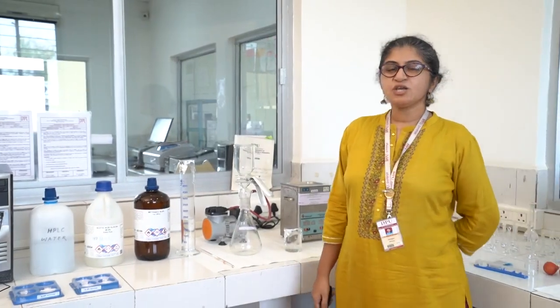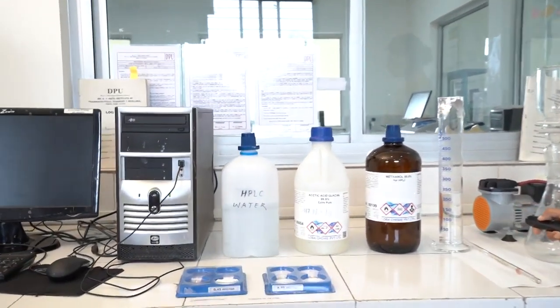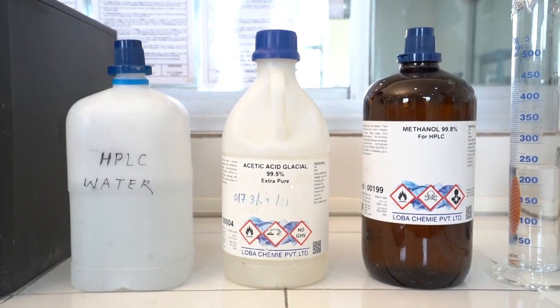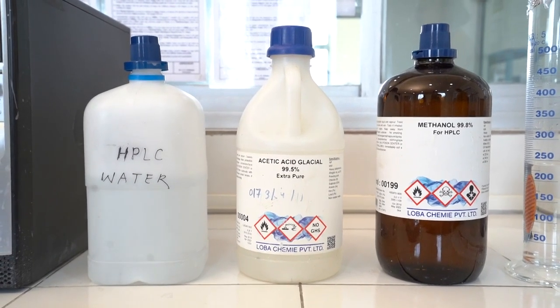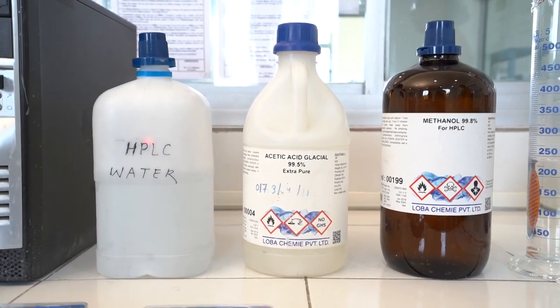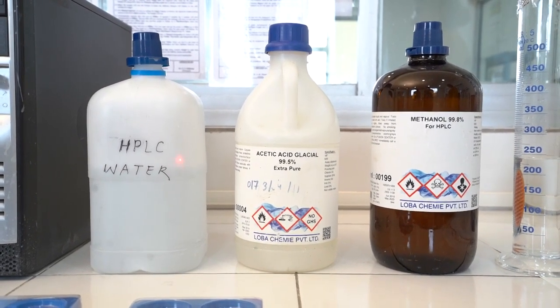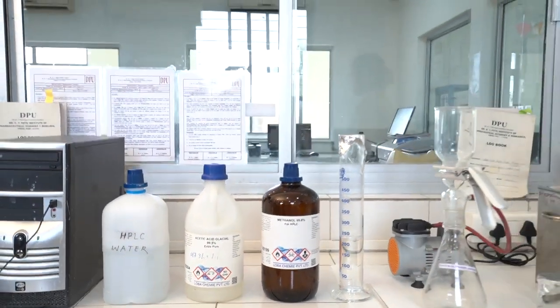In HPLC, all solvents which are used should be of HPLC grade. All reagents and chemicals used for preparation of buffers should be of AR or comparable grade. The water used should be of HPLC grade or triple distilled water. In case of HPLC, PEEK resins are used.